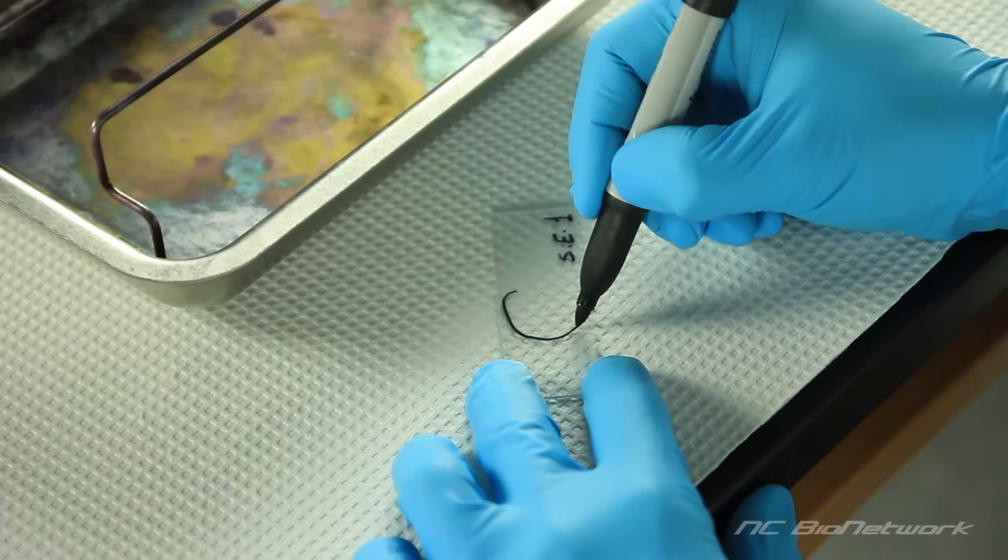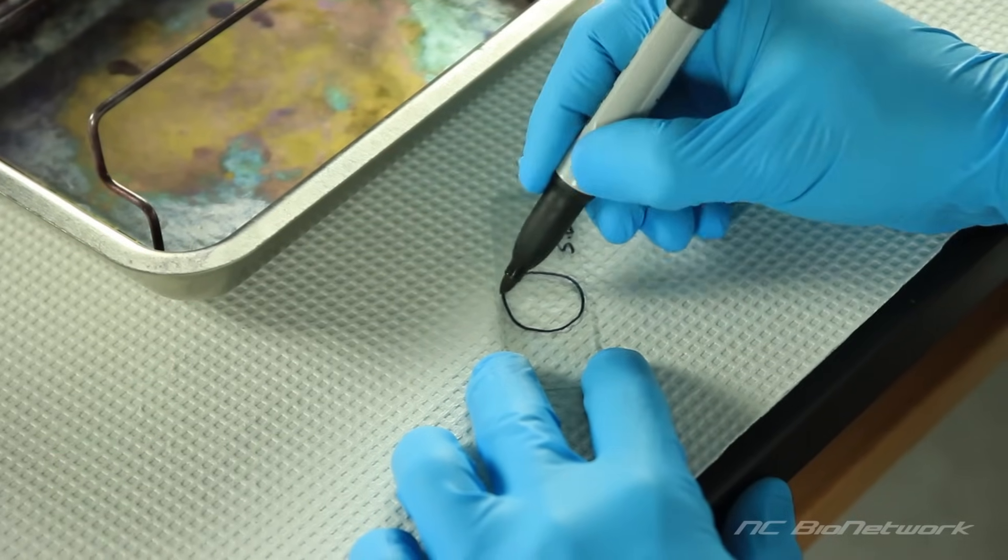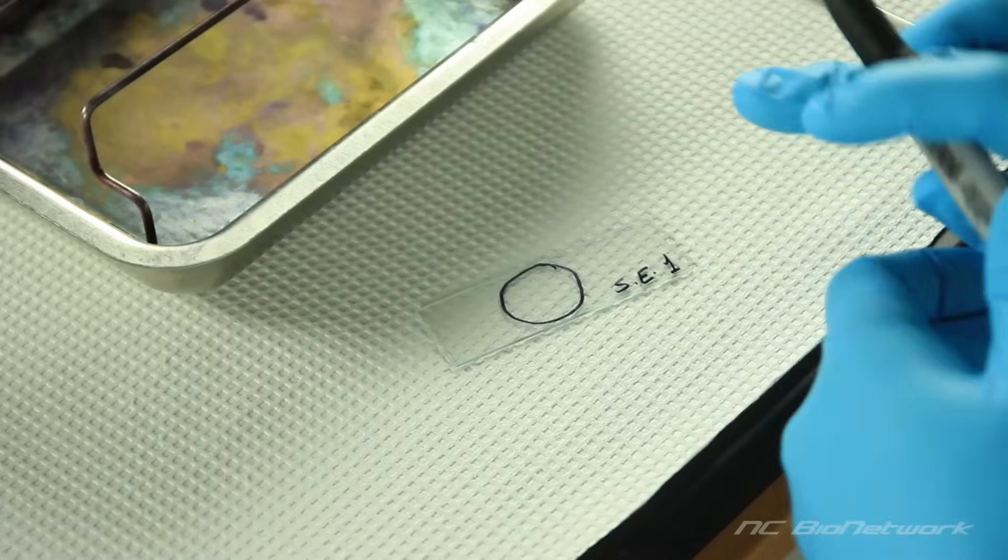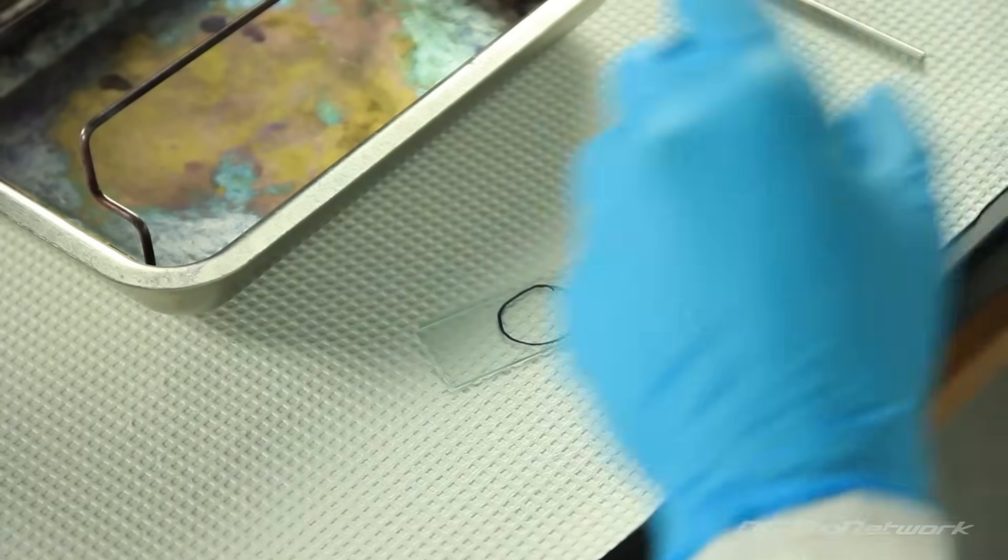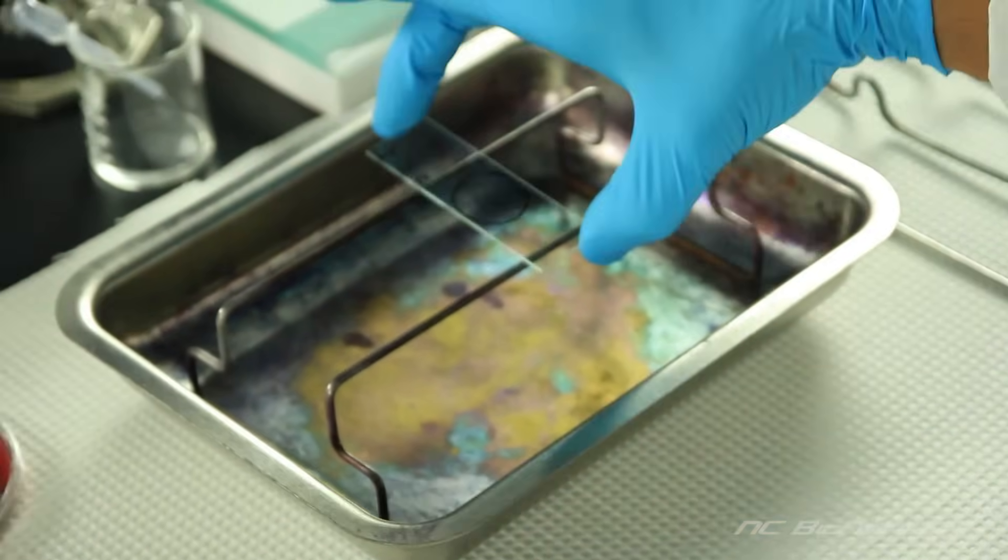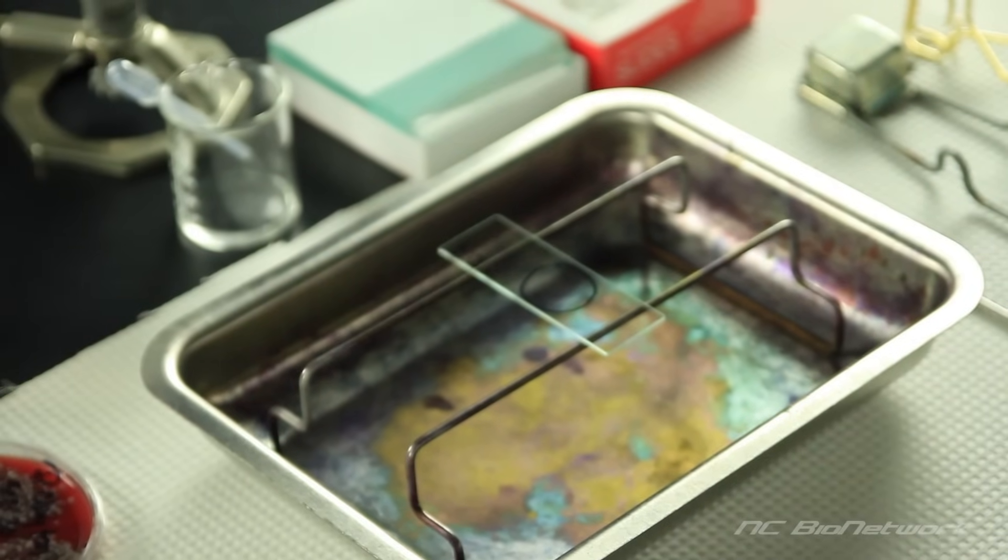Because we're using Staphylococcus from a solid source, we'll draw a circle about the size of a nickel. Turn the slide over so that the circle is on the bottom. This will prevent the marking from mixing in with the sample.